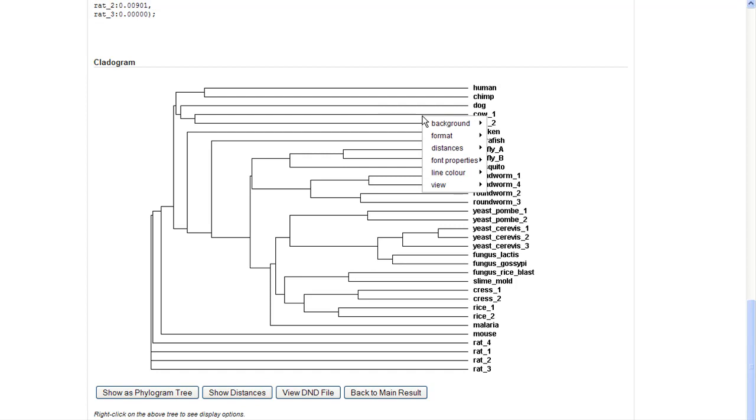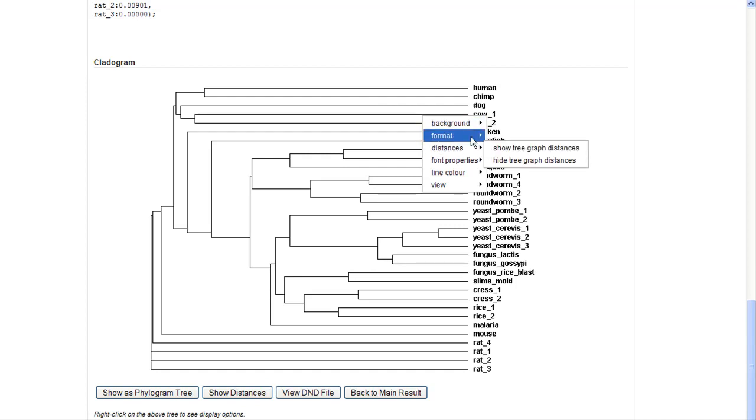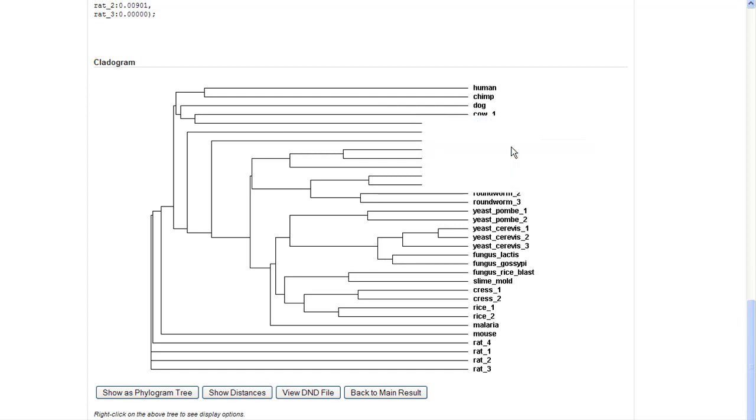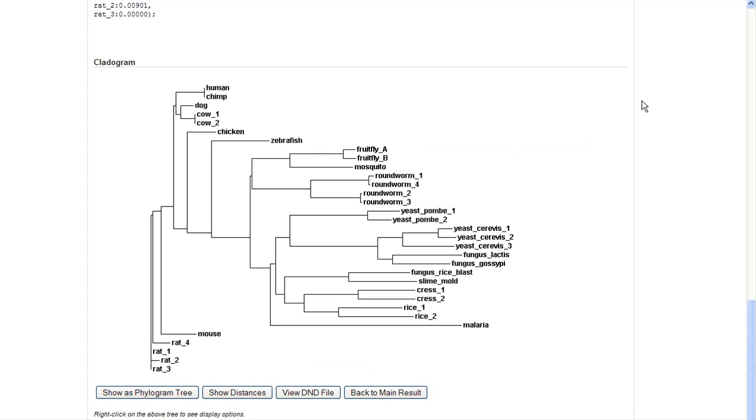If we right click, we're going to have a little bit more editing option. I'm going to change the format from cladogram to phylogram. And now the distances here reflect the genetic similarities or differences.